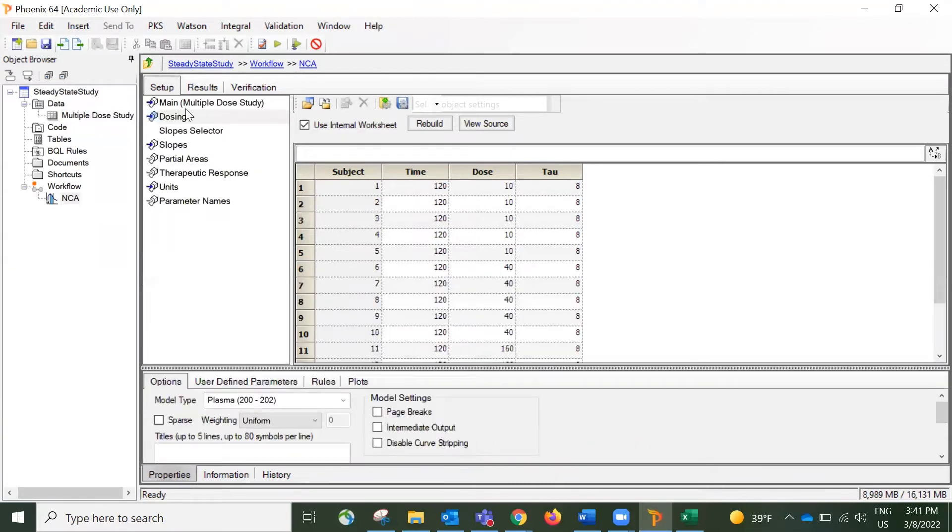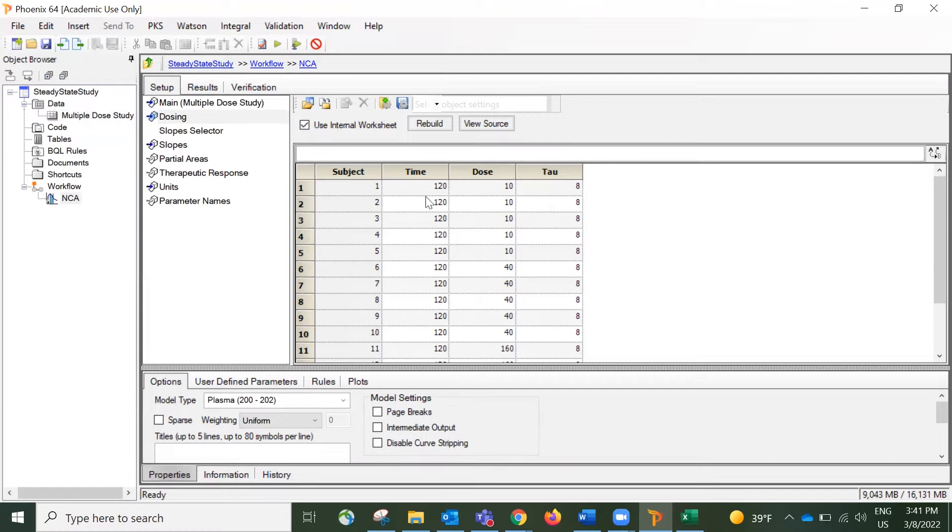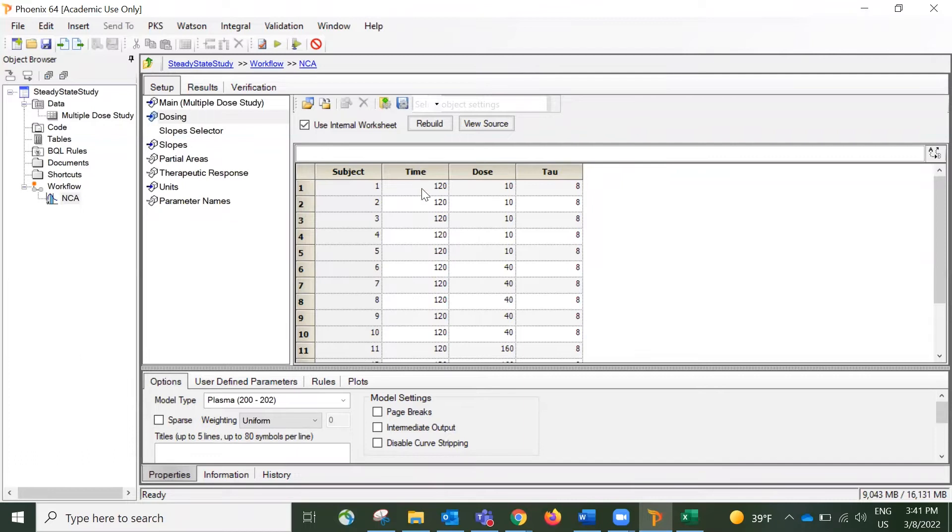And if we look at the dosing mapping table in here, I used an internal worksheet. So this box was checked so that I can enter the correct information. And for the time column, I entered 120, which is the starting point for the steady stage.